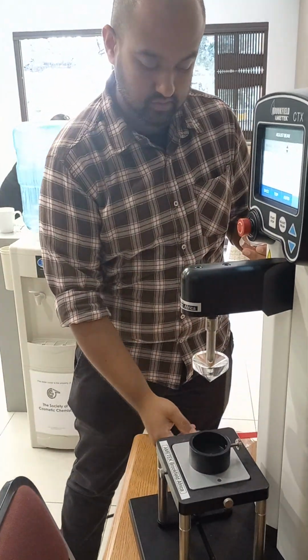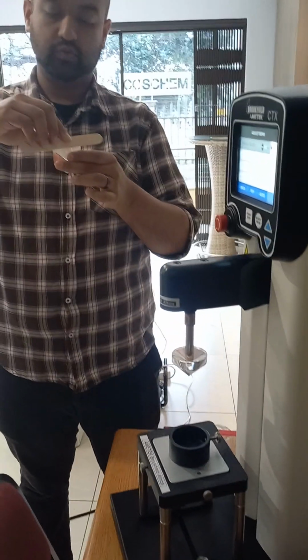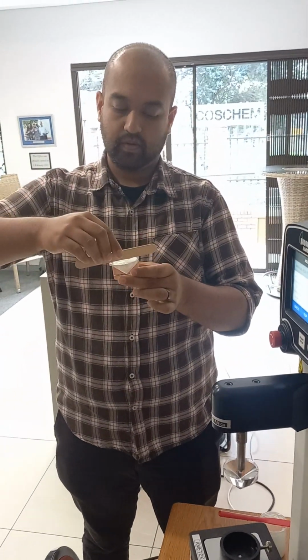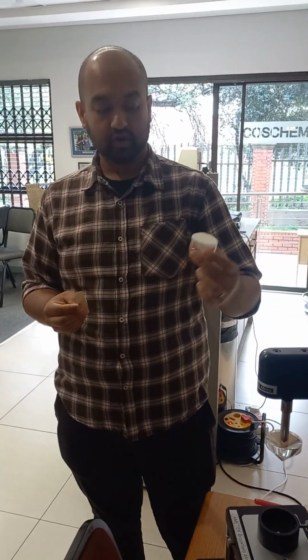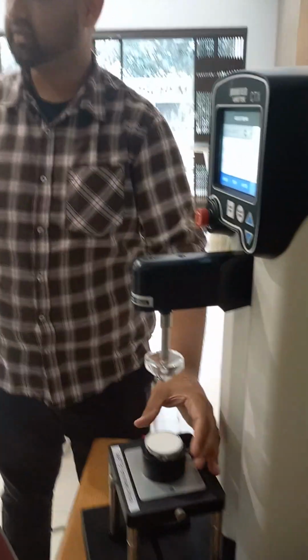And then I'll just use this flat section of this spatula just to smooth it off. So it needs to be completely full, right at the top and flat. And this must be for every sample, so you get the most representative and repeatable result that you're looking for.